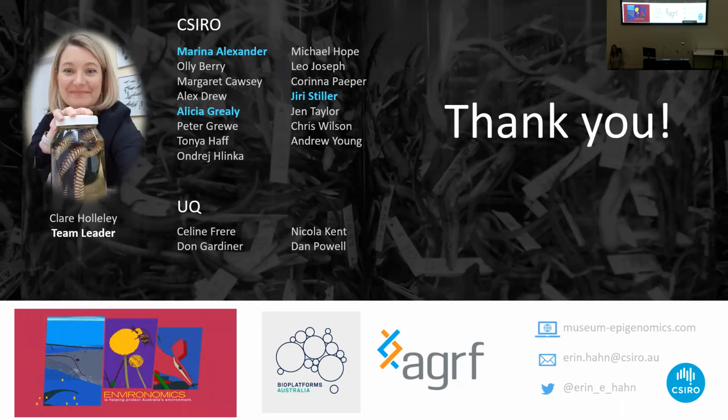I don't see any reason why you can't try it. And I think it would be great to then also get the parallel data sets, because no one's doing FAIRE sequencing, but lots of people have ATAC-seq data for modern specimens. And if you treat the samples appropriately, get it down to the individual nuclei, I don't see any reason why you can't. Okay.